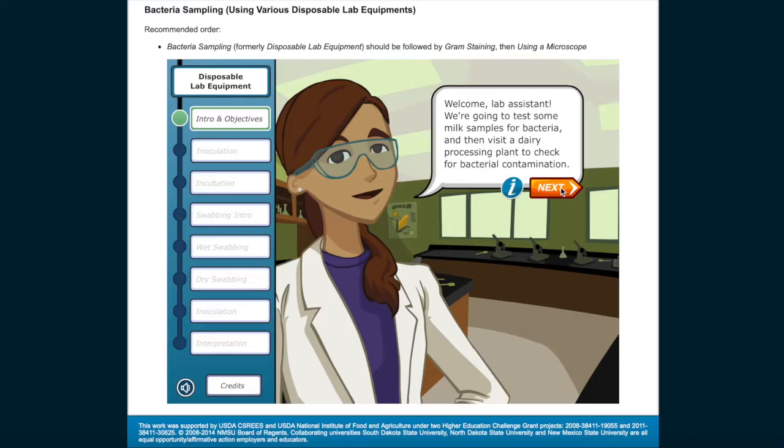Welcome, Lab Assistant! We're going to test some milk samples for bacteria and then visit a dairy processing plant to check for bacterial contamination.